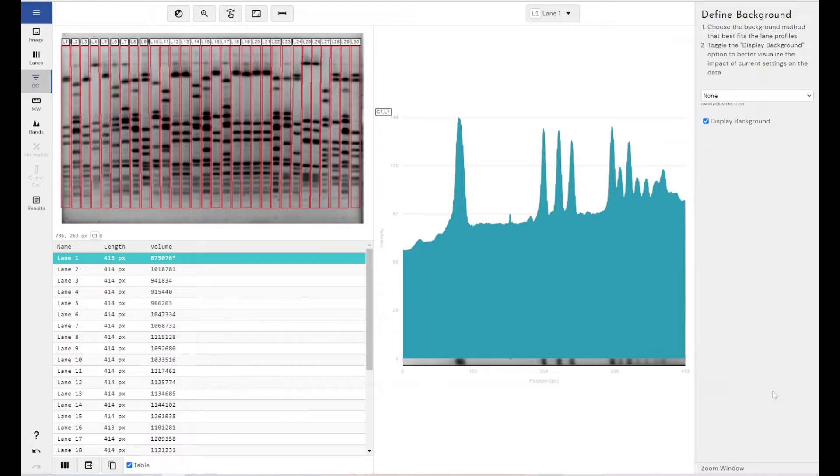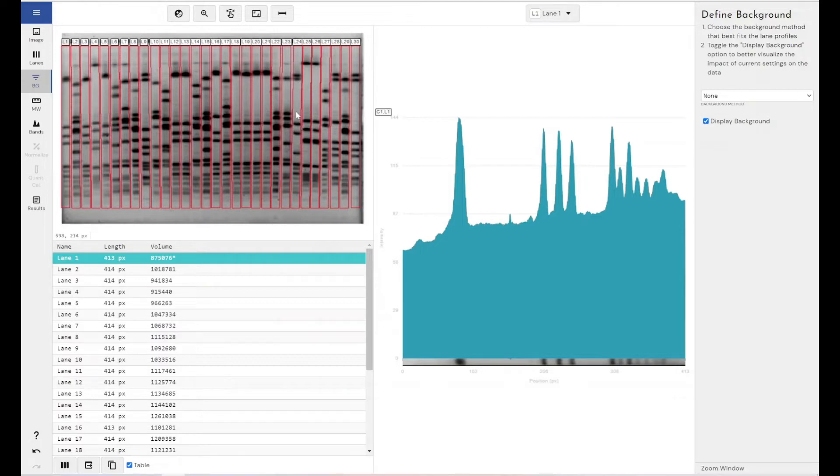Now, when I'm referring to background, I mean these areas within the image between our obvious areas of intensity, our bands in this instance, where it's light grey. So there is a signal within the image there, but it's not one we wish to measure. We want to remove it from our results.